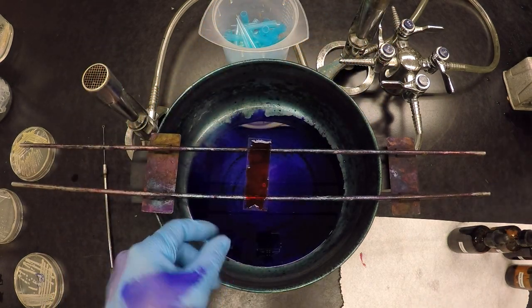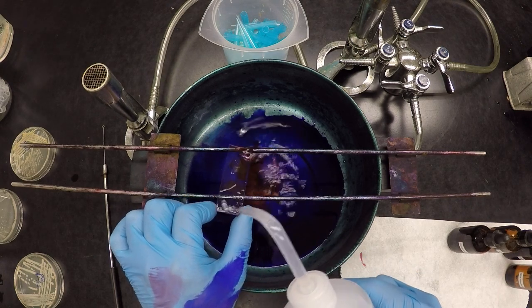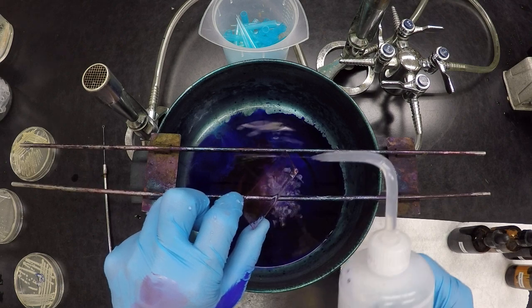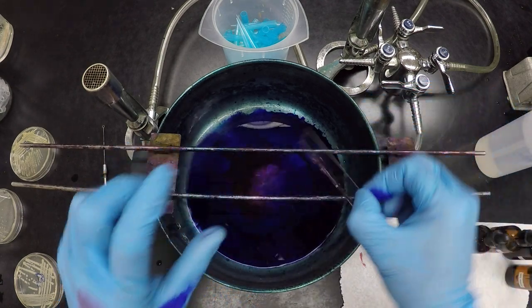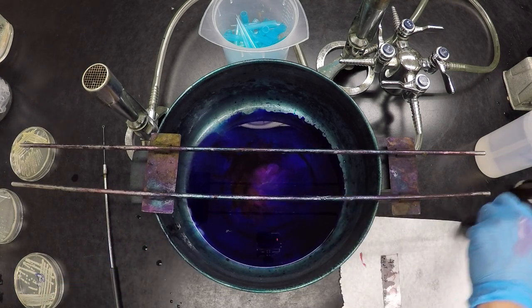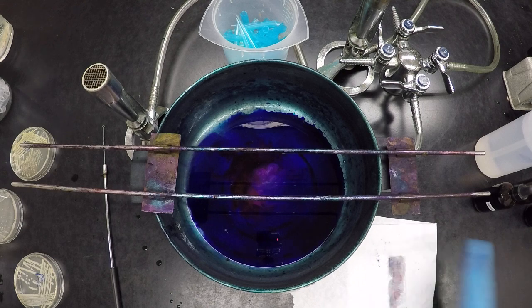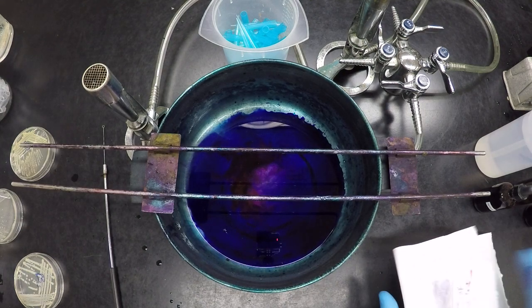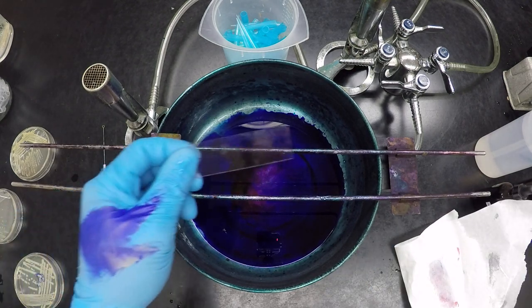Okay, so we want to rinse that off now. Rinse, tap, and then blot. Ready for the microscope.